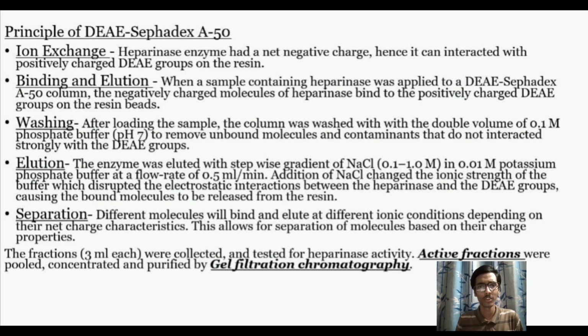So now let's discuss the principle of DEAE Sephadex A50 chromatography. First, equilibration. In this process, the Sephadex resin, which is used as the stationary phase, is loaded in the column, and the diethylaminoethyl groups are attached to it, which gives it a positive charge.